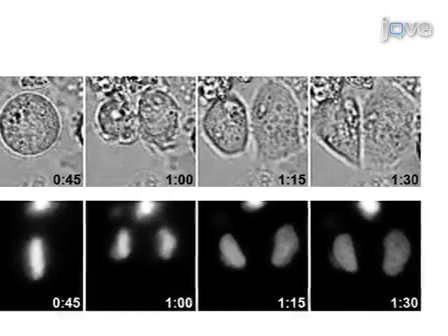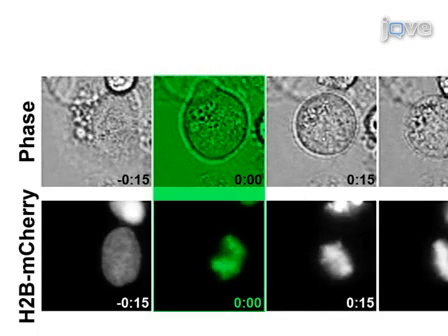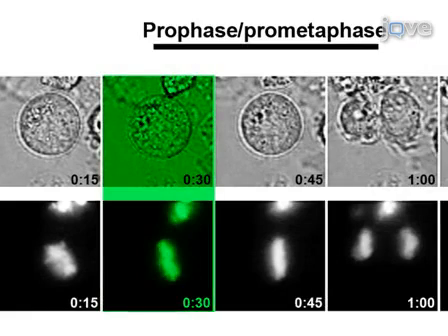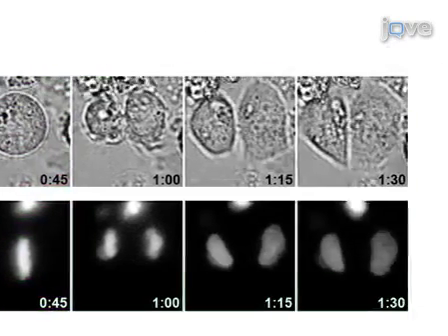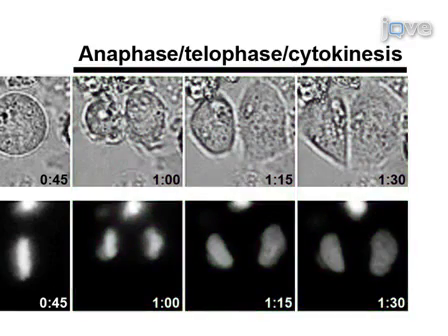Finally, calculate time in each stage of mitosis, designating the frame in which the first sign of DNA condensation or cell rounding is evident as t equals 0. Prophase/prometaphase ends when the chromosomes are aligned at the equator. Metaphase will then proceed until the DNA begins to segregate. Anaphase, telophase, and finally cytokinesis follow, and the cells begin to flatten.